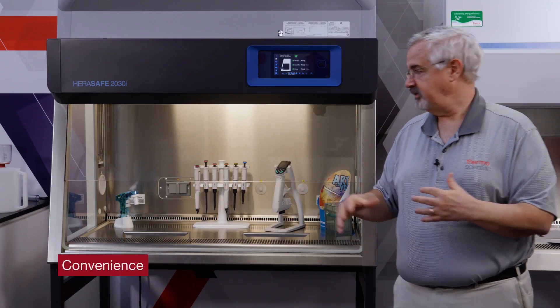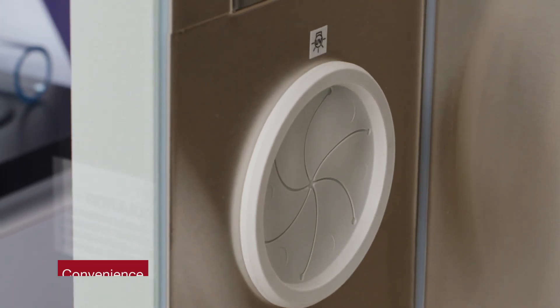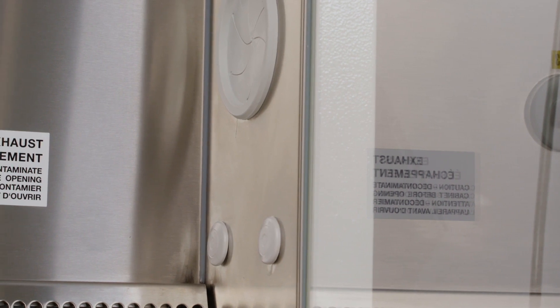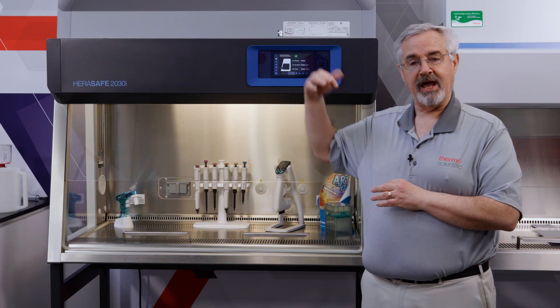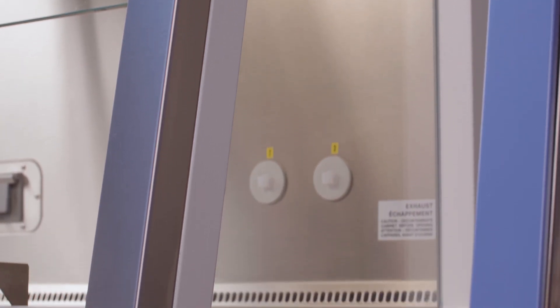For convenience, we have the smart port for the safe passage of data cables, sampling tubes, and power cords into the cabinet through the sides. We see two media ports on each side and three more in the back. The ones in the back can be accessed from the top of the cabinet, so you don't have to use up the valuable side area — helpful when cabinets are close to walls or other equipment.